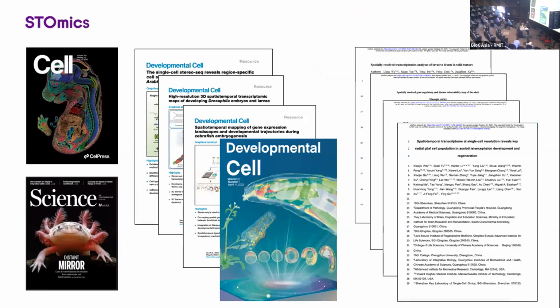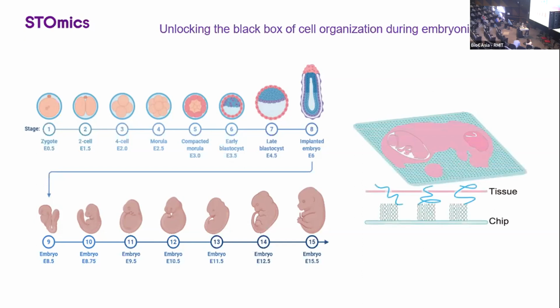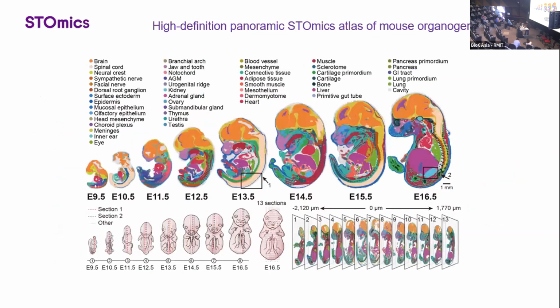And we have some papers coming out. The upper left one is our methodology paper, and I will show a little more information about this part. Embryo development is very important for mouse studies and for development studies. So we selected some of these organs for sequencing and analysis. Here is a result. You can find this result on the first page of the paper.